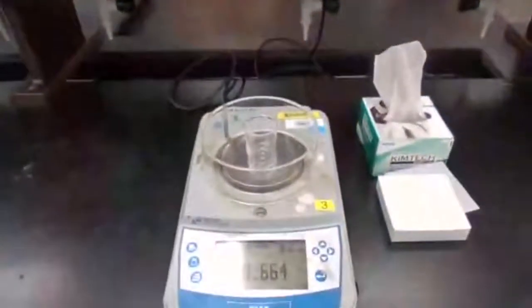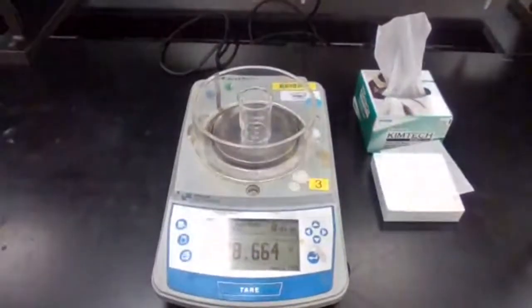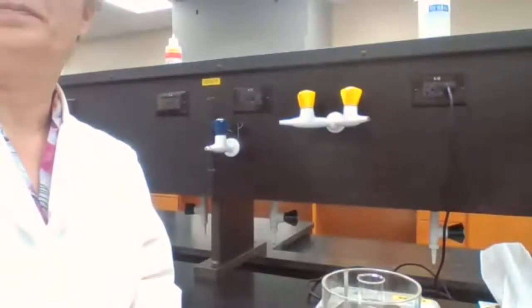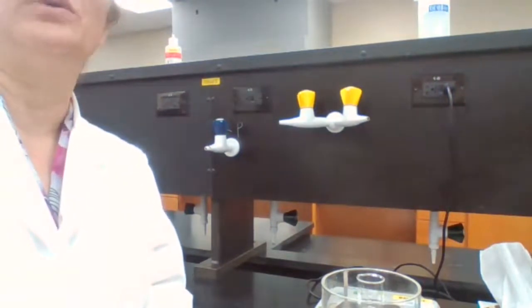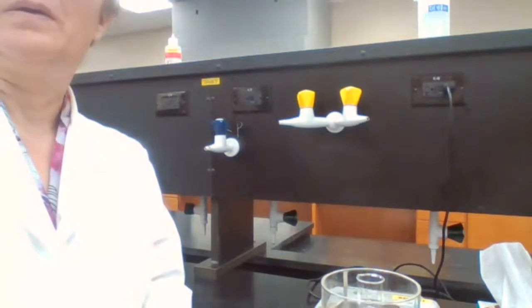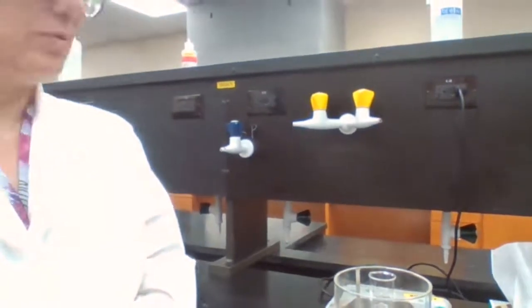Record the mass of the beaker: 28.664. I'm sorry, 28. Sorry. 28.664. Yes. 28.664.